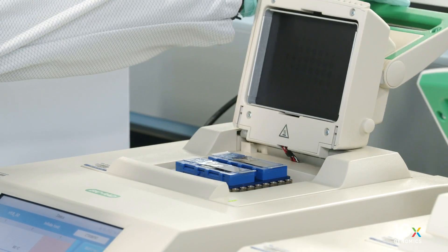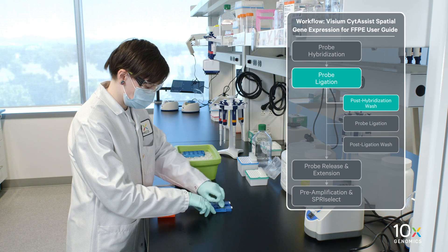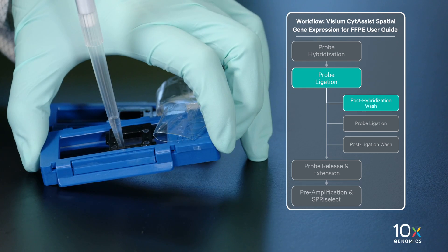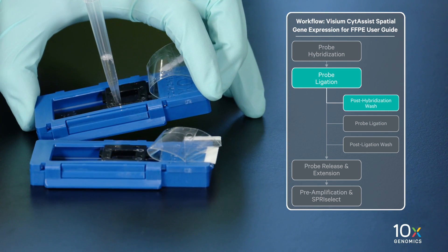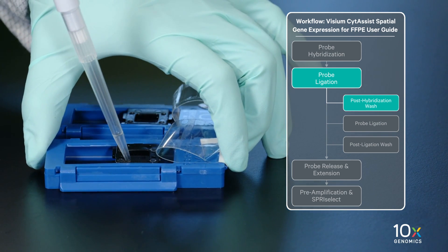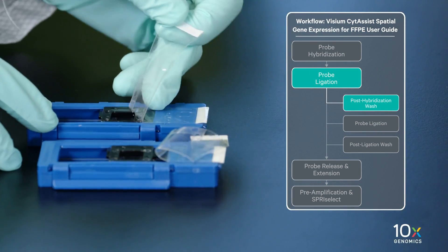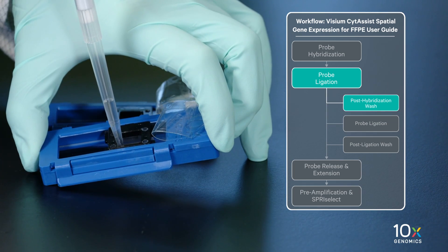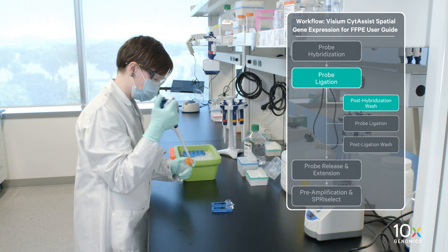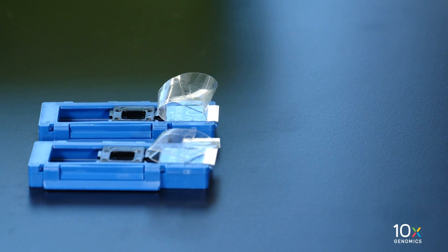Remove the tissue slide cassette from the low profile thermocycler adapter and place on a flat, clean work surface. Exercise caution as the slide is very hot. Peel back the Visium Slide Seal. Using a pipette, remove all FFPE post-hype wash buffer from the wells. Add 300 µL of 2X SSC buffer to each well. Let the cassette cool to room temperature for approximately 3 minutes before proceeding to the next step.